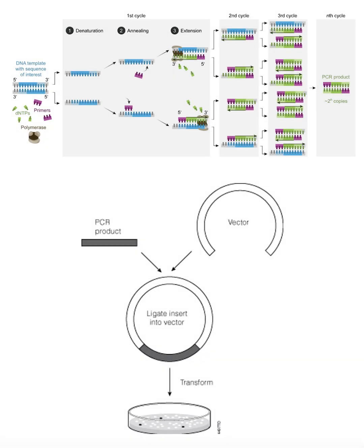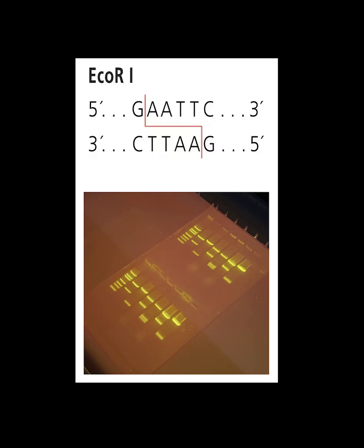Once we know which gene is mutated, the next challenge is to identify the exact DNA mutation. In order to do so, we need to PCR amplify the mutant allele, ligate it into a cloning vector, transform the recombinant plasmid into bacteria, select for successful transformants, and finally, perform restriction digestion and gel electrophoresis to verify that our insert is present.